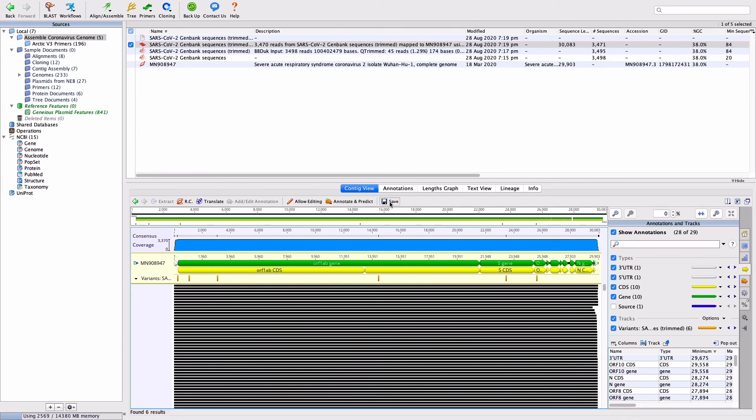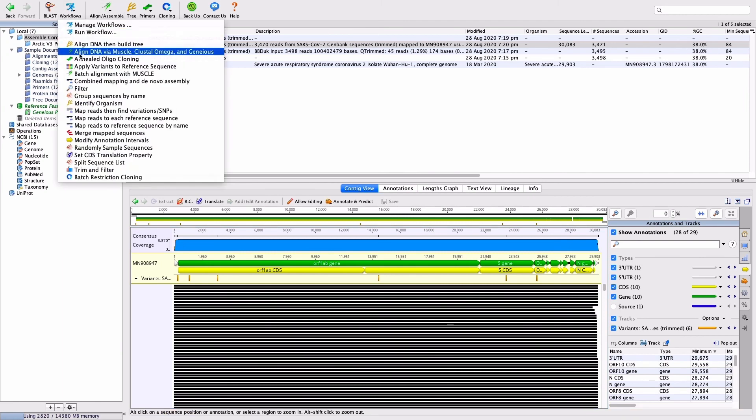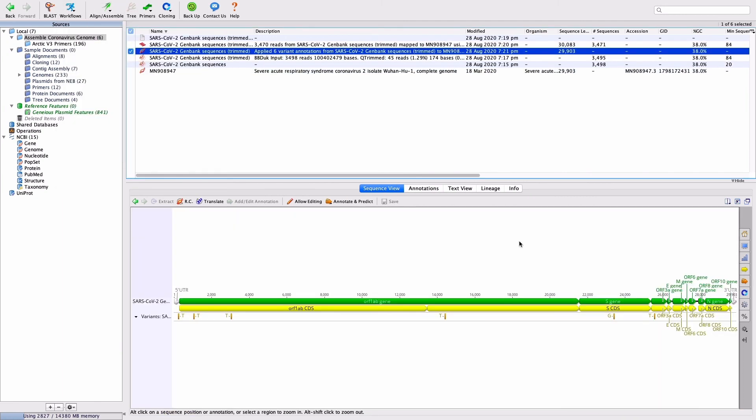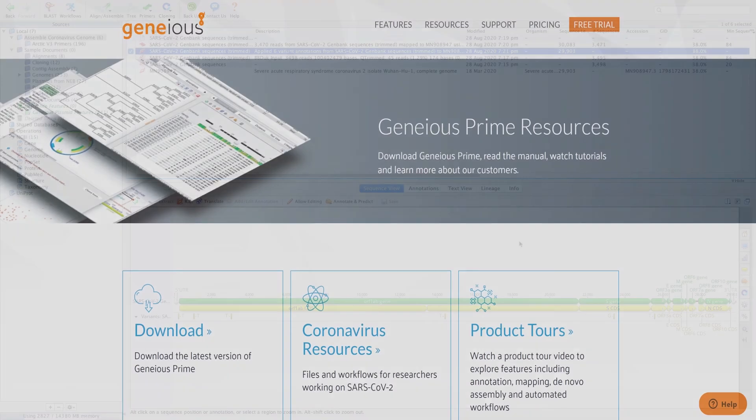After the SNP calling has been completed, save the results and then go to Workflows and Apply Variants to Reference to generate a new consensus sequence containing the variant bases.